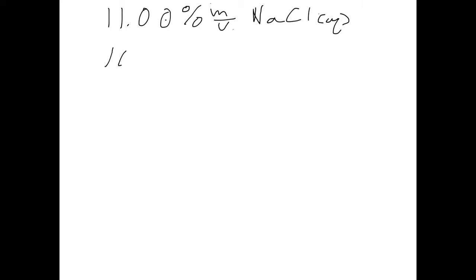And we want to make 100 milliliters of it. How would we go about that in lab?